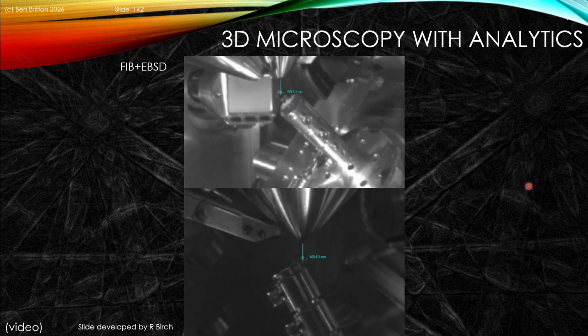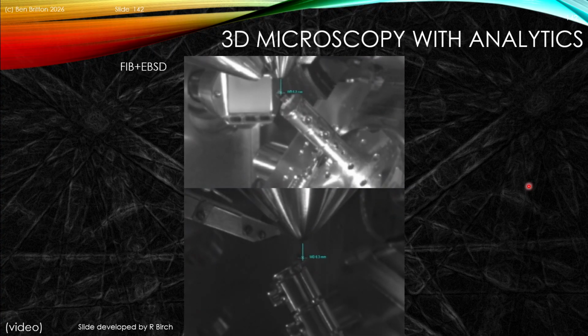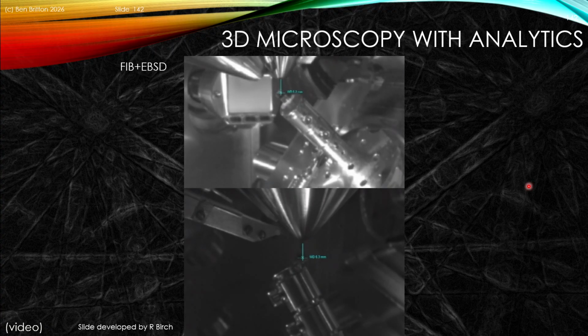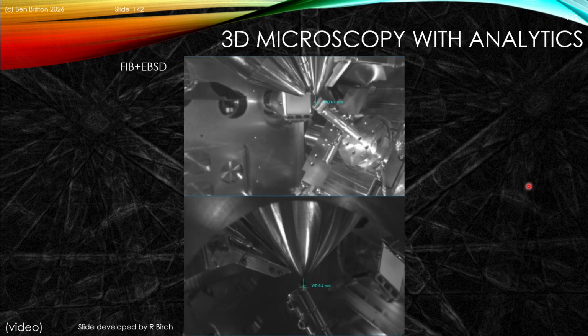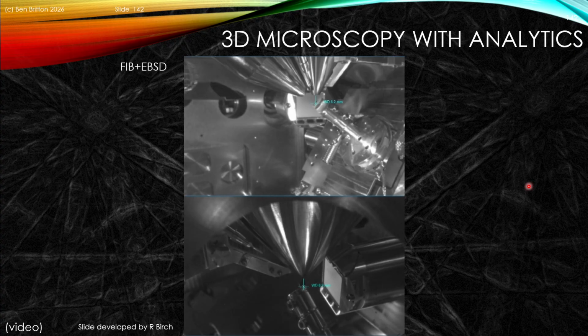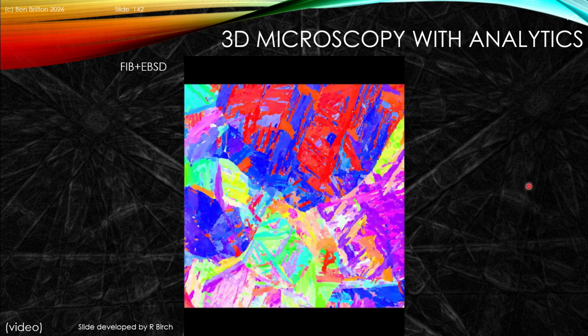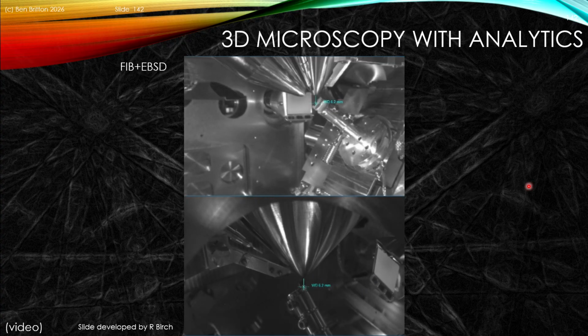So here we see how the microscope is operating. We're going to do the FIB process, and the sample moves around. It's been set up on a long post, and the rocking has been aligned. So we're FIBbing away to remove each surface, get a nice finish. We then insert the EBSD camera. This has been sped up, of course, just to protect the camera between FIB slices. We collect an EBSD map, where we show the crystallographic structure. We're then going to remove the camera.